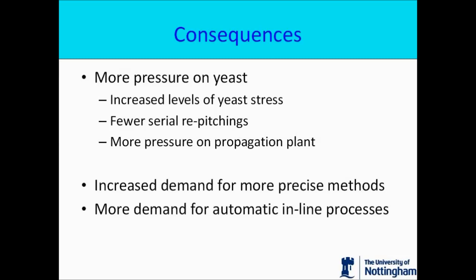And clearly that increases all sorts of pressures in terms of what you can do with yeast. It certainly obviously leads to an increase in pressure on things like propagation plant. And in order to manage that process, I think it's fairly obvious that you need to have it underpinned by very accurate methods, and preferably methods that you can use in line.